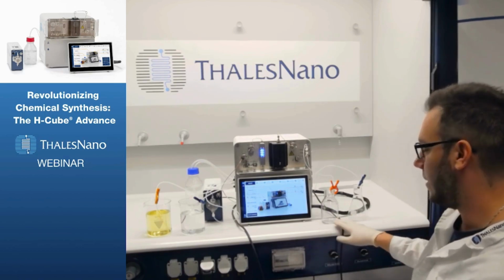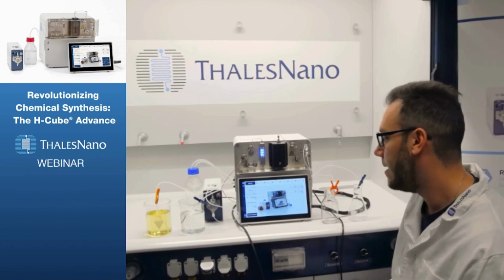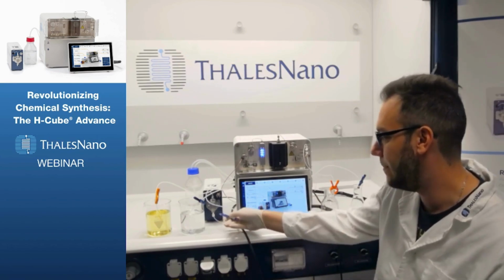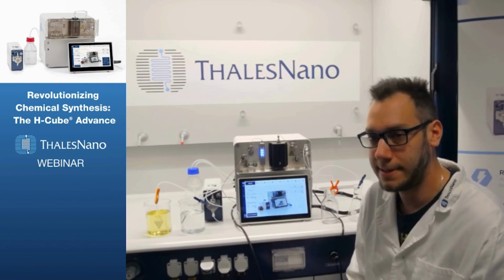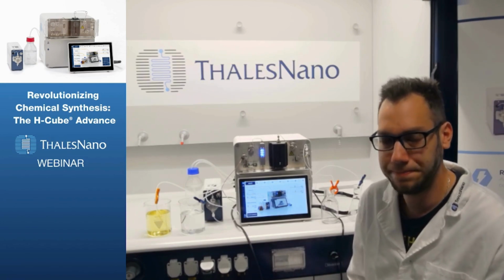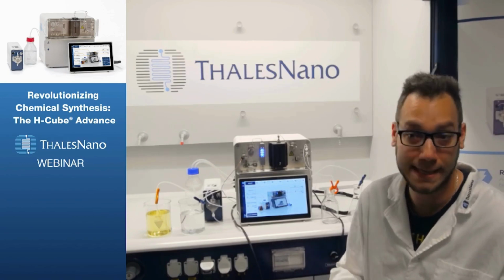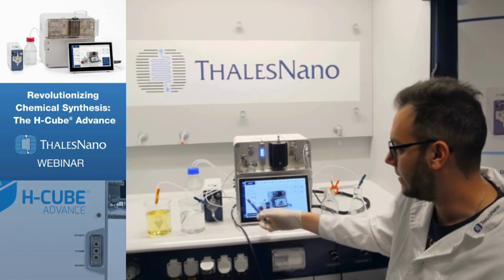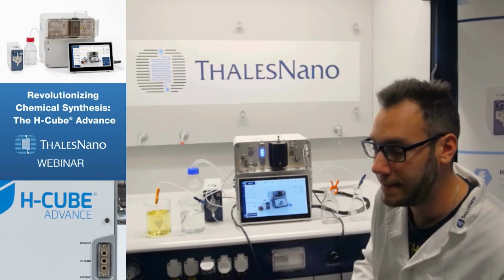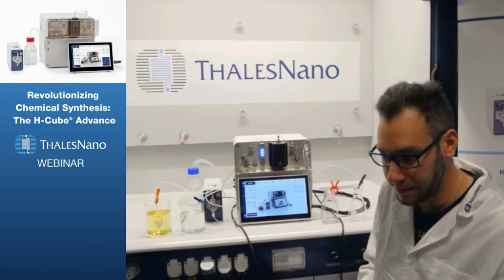And then we have two other flasks on the other end, one for the waste and one for the product collection. In the middle, you can see the HPLC pump and the H-Cube Advance instrument itself. So firstly, let me briefly talk you through the front panel tubing and what's happening when you start the experiment. The first thing that happens is there's a selector valve on the side of the instrument that allows you to select between the starting material or the solvent.